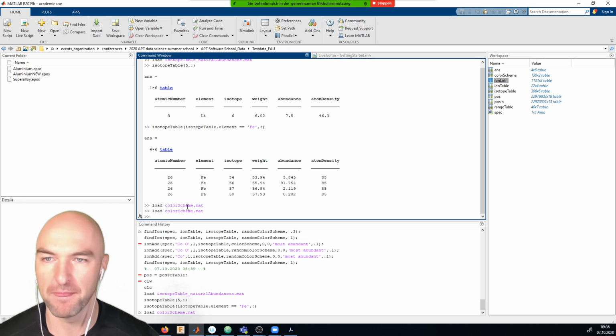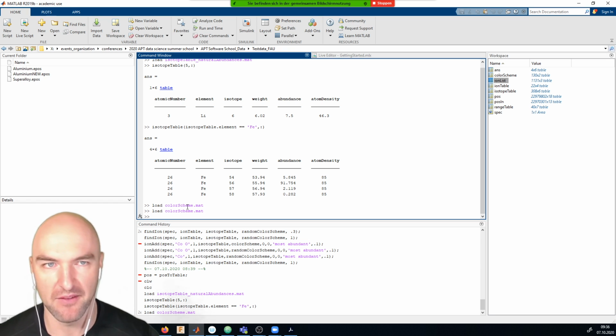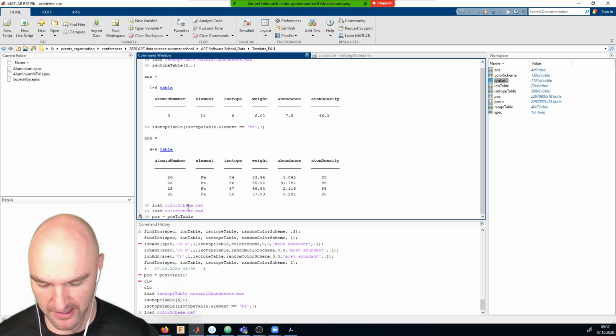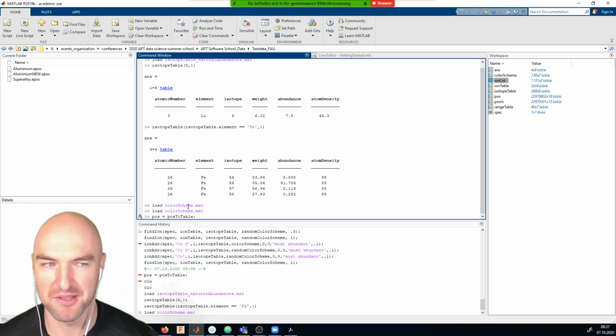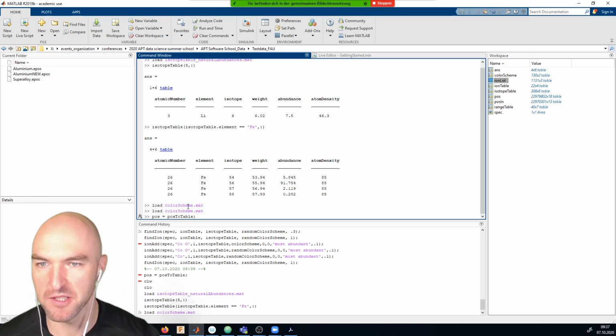All right, it's actually very simple. All you need to do is assign a variable, and I usually use pos equals read pos. Sorry, I'm still used to the very old one. Pos to table, yeah, pos to table, and then always use the semicolon to suppress the output, because if you've got a long data file, it will print like God knows how many columns into your workspace.